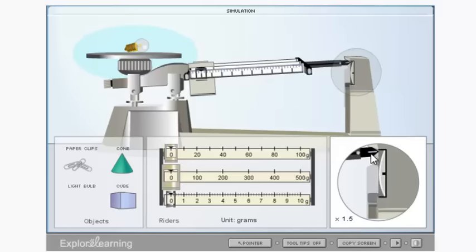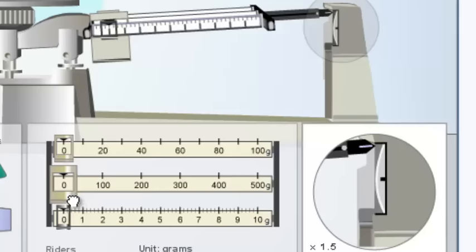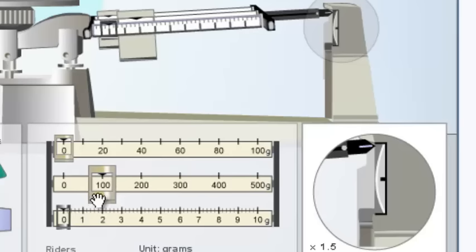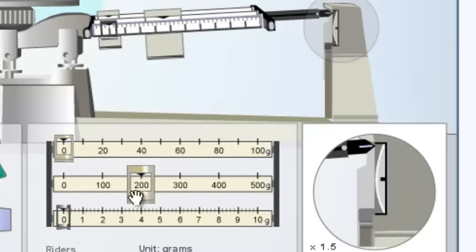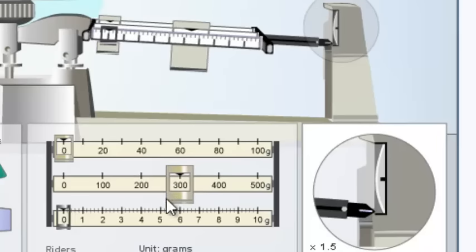So what we have to do is find the right amount of mass here on our riders and drop this pointer down to this line. The first thing you want to do is start off with the 100 grams and you keep going until it starts to move. So 100 grams isn't enough to move it so I'm going to go to 200 grams. 200 grams is not enough so I'm going to move it again. 300 grams drops it to the end. We know that 300 grams is too much mass so we bring it back.